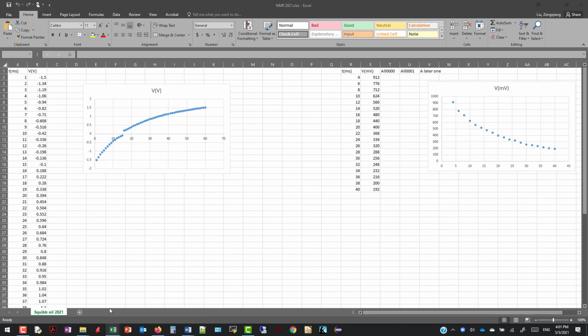And this is my result from this year. It seems like there's a little more discrepancy here. Maybe it's just me having more data. Whichever is the case, you could, if you want, delete a couple of these data points close enough to the 0. The lower the magnitude, the higher the relative uncertainty.